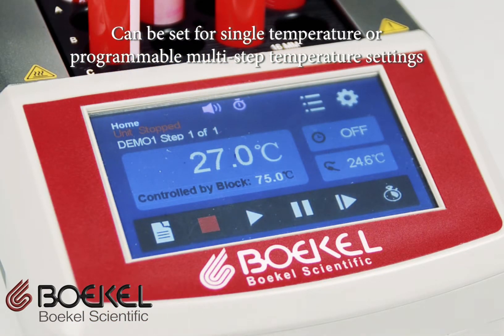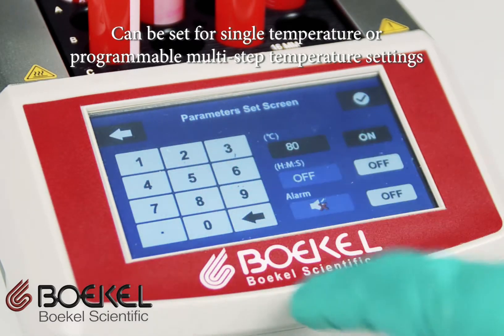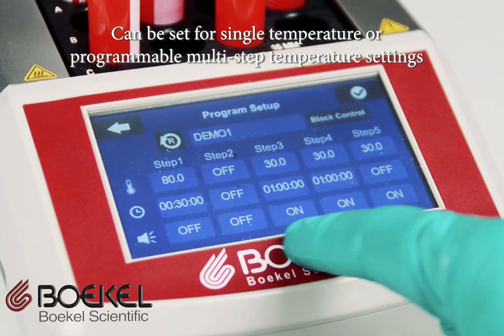The unit can be set to operate at a single temperature, or it is completely programmable and capable of timed heating, multi-step temperature programs, and thermal cycling programs.